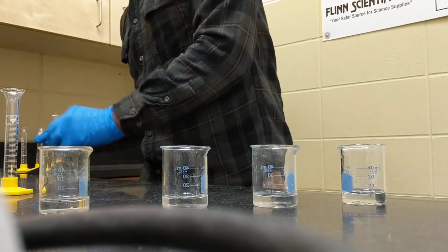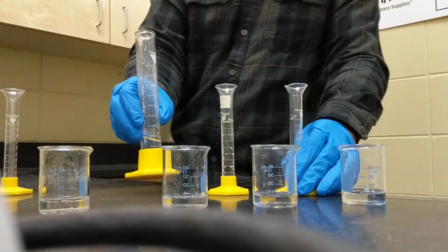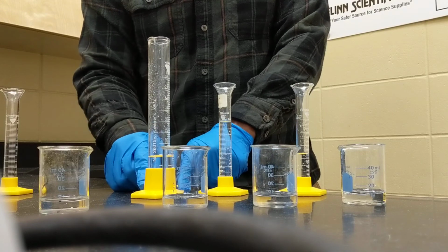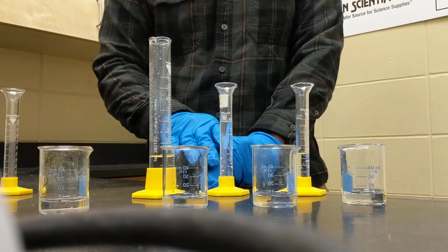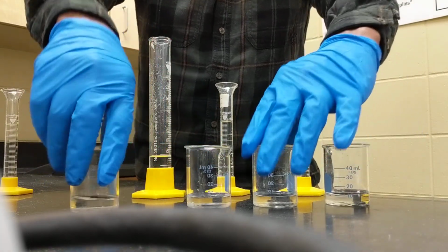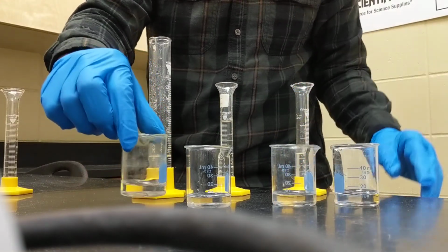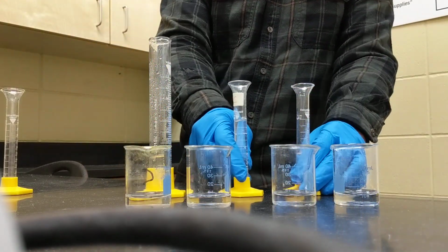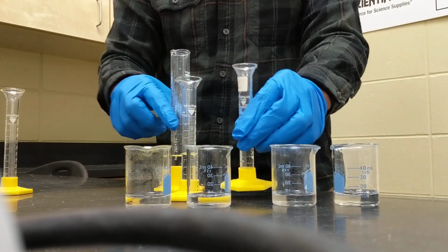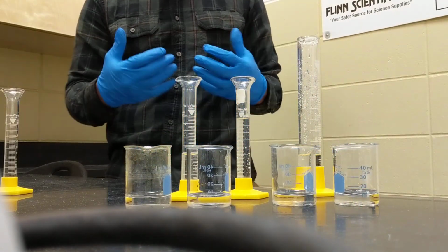I took the various volumes of my sodium thiosulfate, and I have 5 milliliters, 10 milliliters, and 15 milliliters. Notice I have 3 graduated cylinders and 4 beakers. Well, I use 4 beakers because I like to incorporate a control whenever I'm doing this investigation. This means that one of the beakers will not receive any of these substances. Just for continuity's sake, I'm going to put 5 here, I'm going to put 10 here, and I'm going to put 15.